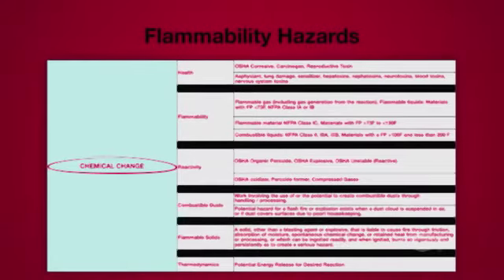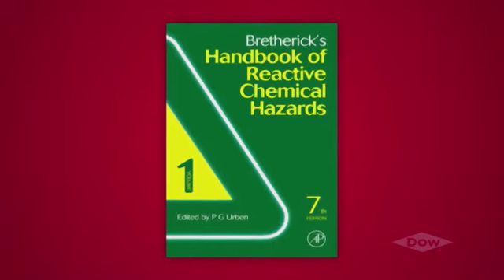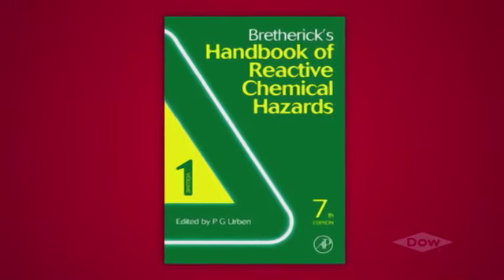For flammable solids, consider all of the potential conditions that could cause the material to ignite. That includes assessing storage, proper handling techniques, and waste management. Your EH&S expert can be a tremendous help in this area. Also, determine worst-case scenarios and document how you will respond if there is a fire. Material reactivity is the final consideration in this section. Use basic thermodynamic properties and calculations and online references such as Bretherick's Handbook of Reactive Chemical Hazards or SciFinder to further evaluate the reactivity of materials.